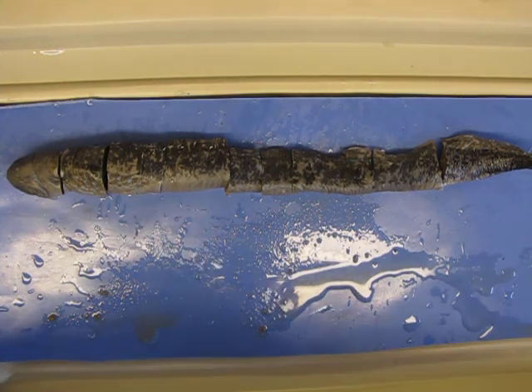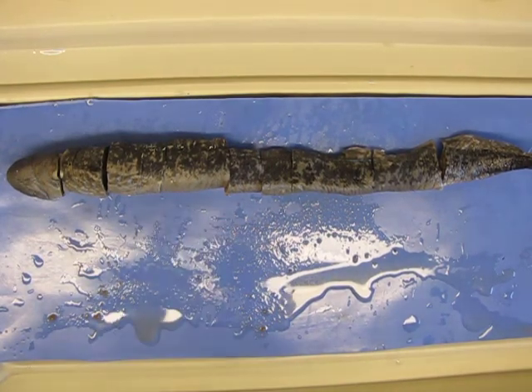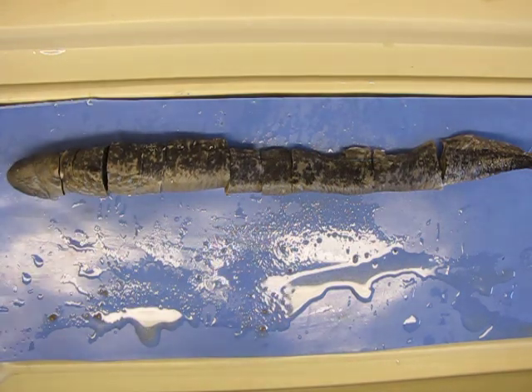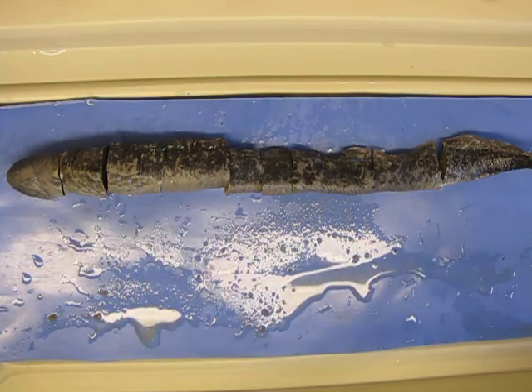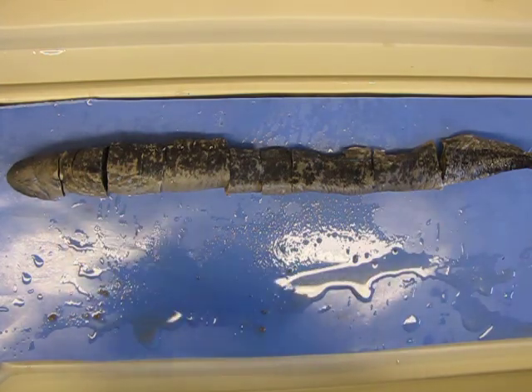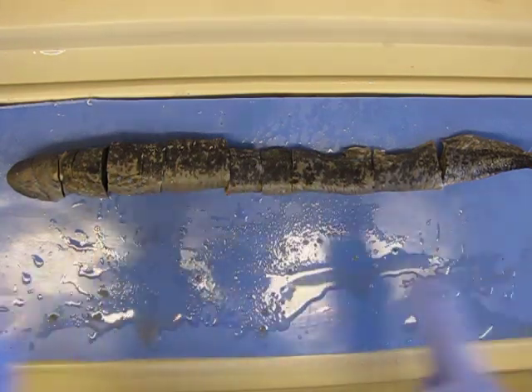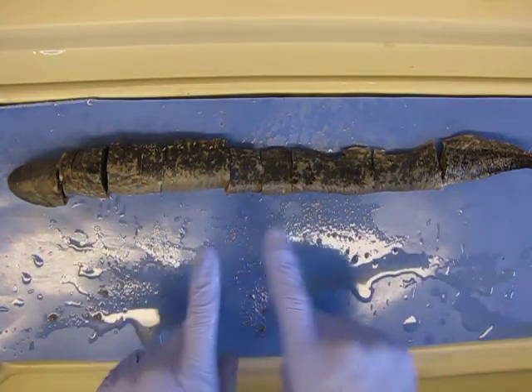So every year I'll do the transverse sections, also called cross sections, slightly differently, but roughly the same areas so that some of the major organs that you don't see as easily or you see differently in the sagittal section you'll be able to see on these cross sections. So get the lamprey that I prepared for you. Use this as a guide, but know that these sections might not be exactly in the same spots, but you should still be able to use it to identify the structures you need to.